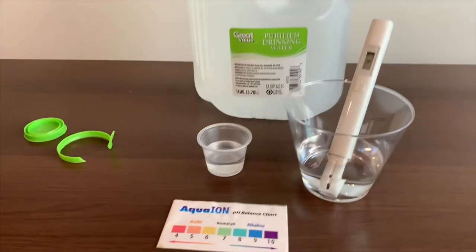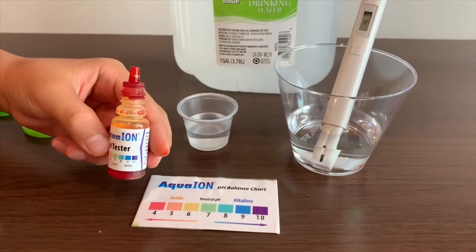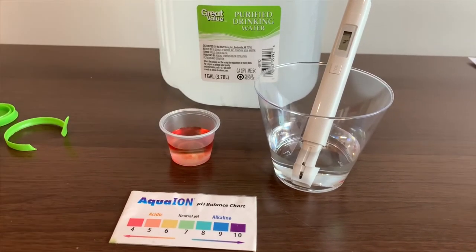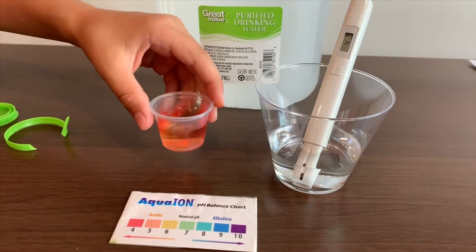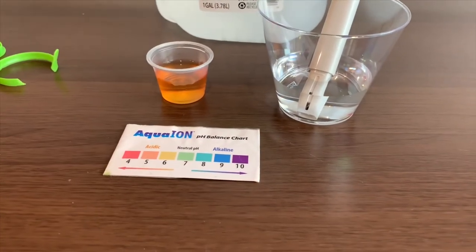Now let's test the pH level. If you want to buy this pH tester, check the link down below. Only do two drops. Let's stir it a little for a better result. I give this a 5 — this is acidic.